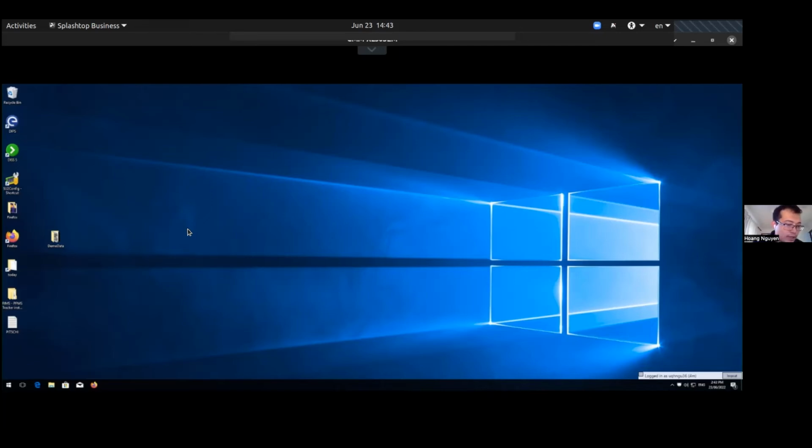That's one of the things the users found quite hard when we rolled this out, because they didn't have that beforehand. They would just go in, use the instrument and walk off. If nobody else is waiting for it, that's fine.